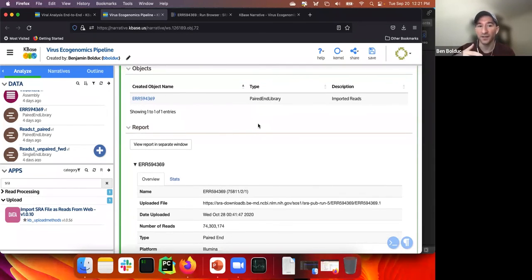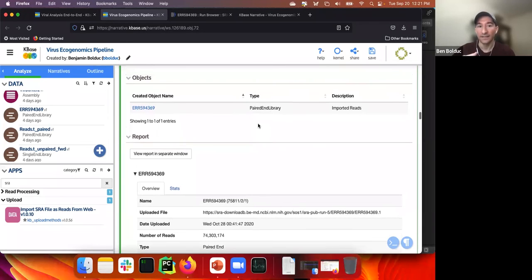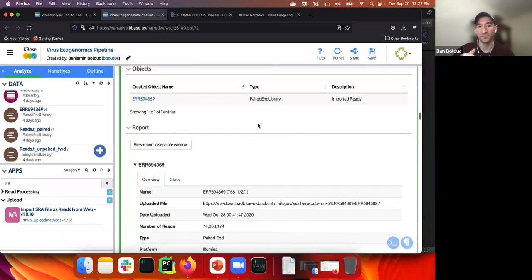And so you never find yourself in a situation where you're putting input data into an app that can't accept it. In Cyverse, you could. I could say FASTA file, and you have no idea if I'm talking about reads or general contigs or virus contigs or any of that. And in KBase, I don't want to say can't, but it's much, much harder to make that same mistake.